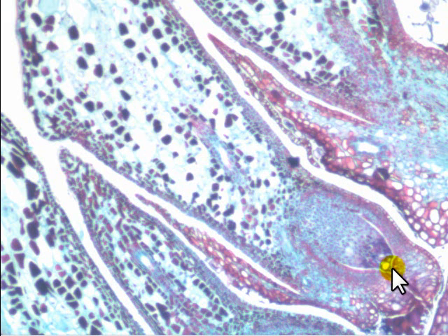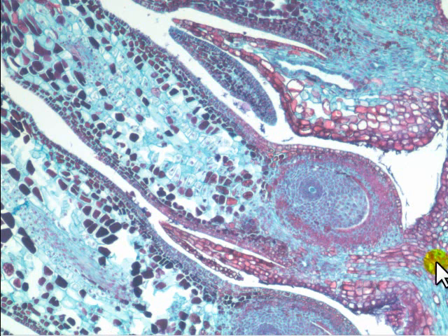In fact, as you can see the opening into it, what is that called? The micropyle. And what's another term for megasporangium, kind of a common term? An ovule. This entity right here will develop, if all goes well, which it didn't for this one, into what? A seed. A seed. And so there is what you have. Oh, here's another one. Very nice. What's this called out here again?